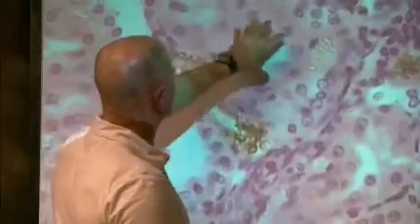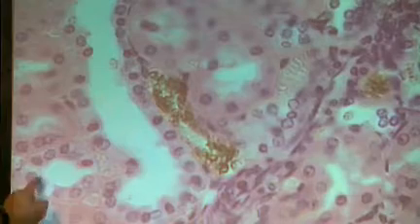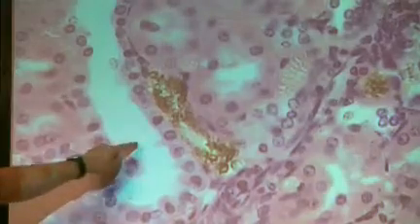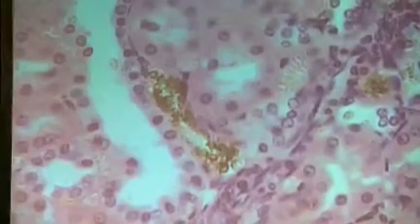On the test, I would ask stuff like here, where you can definitely see that it's a tube. I'm not going to ask for a bunch of cells kind of smushed together. You're going to see a tube, okay? A tube like this or a tube like this. If it's got stuff in the middle of it, it's proximal. If it doesn't, it's distal. All right.